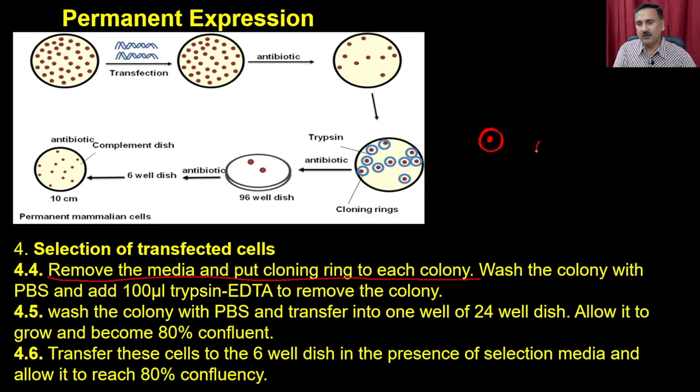So it's actually going to be like this, okay? Small, okay? And this side is going to have the glue. So when you remove it and keep it on this, it is actually going to remain stuck. And then you can do whatever you like with this. It's going to be isolated from the other colony.